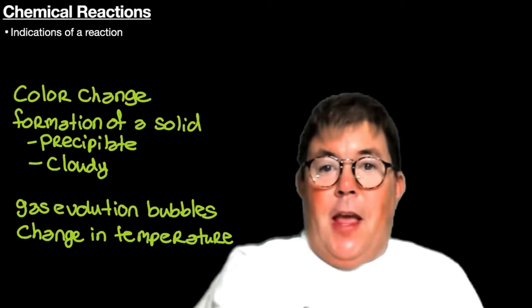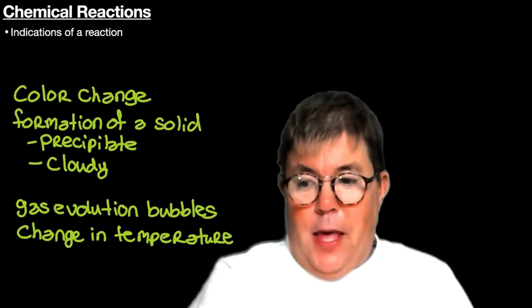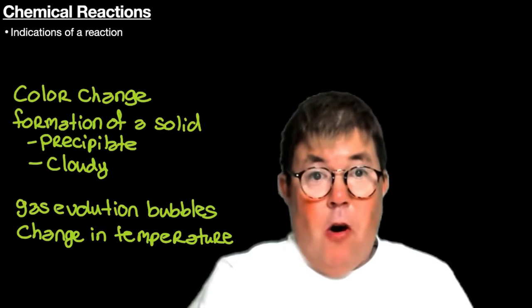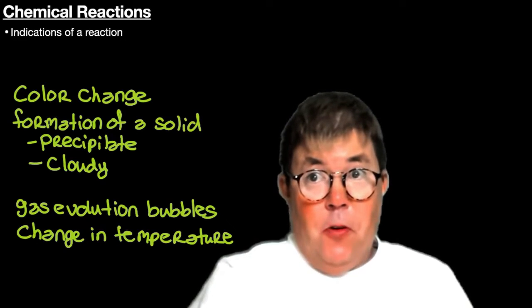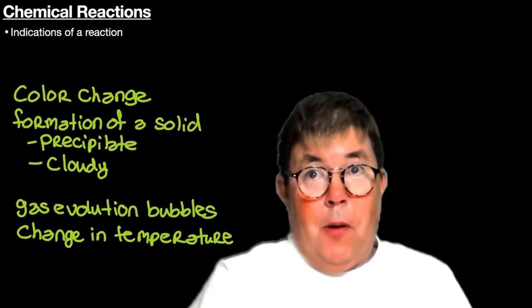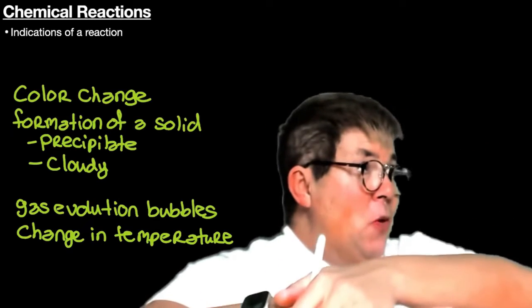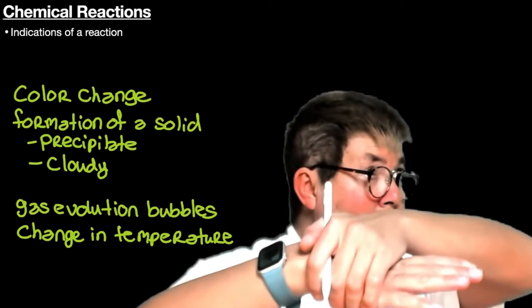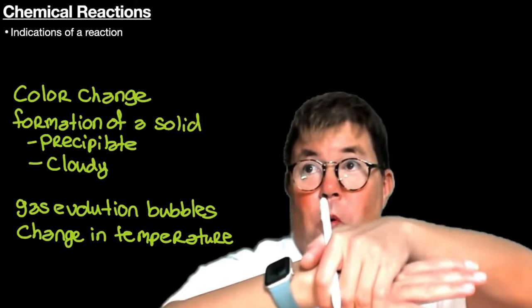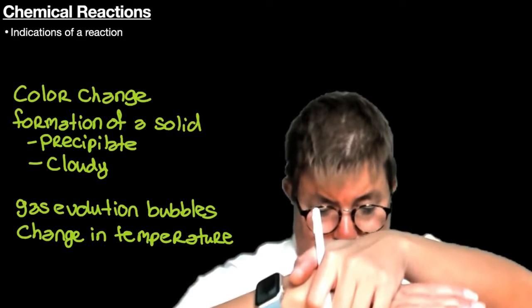For the change in temperature, because we are carrying out the reactions on a small scale, it may be harder to actually observe. Many times you can put the well plate on the back of your hand and you can feel a particular well either warmer or cooler than the room temperature.